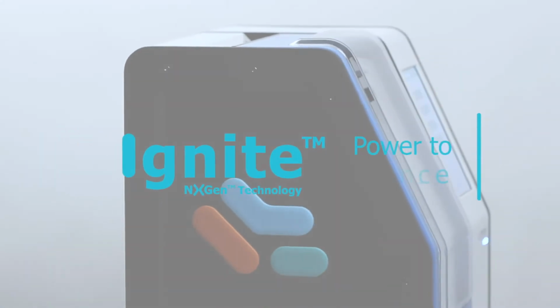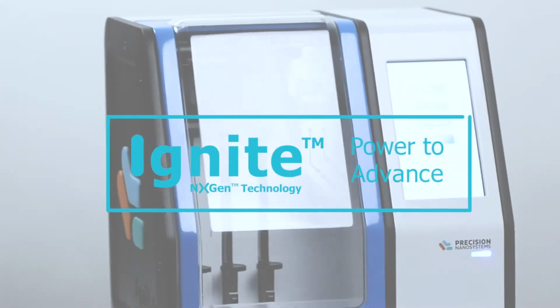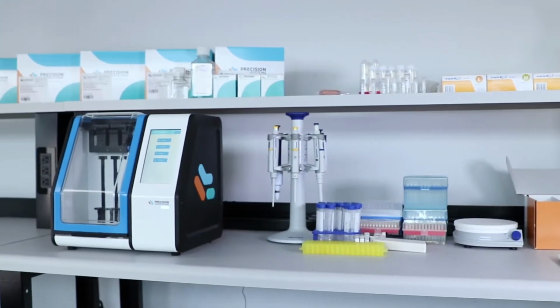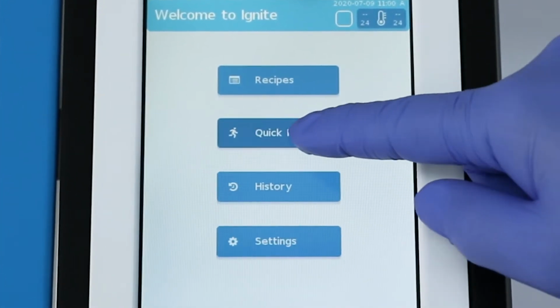The NanoAssemblr Ignite is a powerful tool for advancing your nanomedicine development. We took our NxGen technology, which was designed for GMP production, scaled it down, and designed a system around it to enable scientists of any skill level to explore the nanomedicine design space.